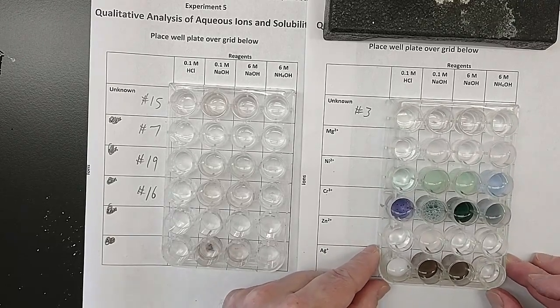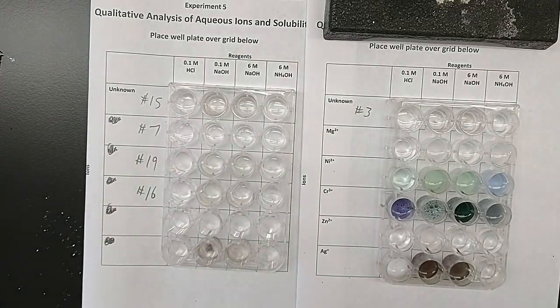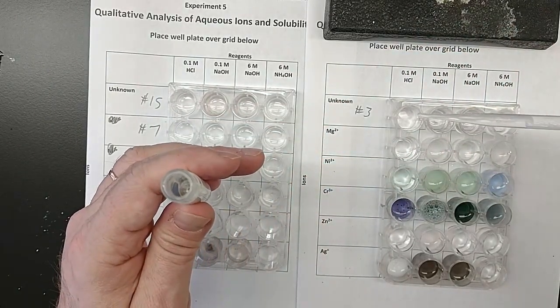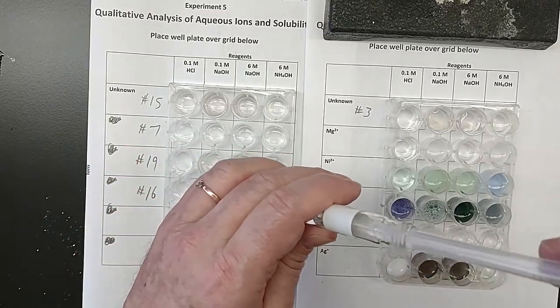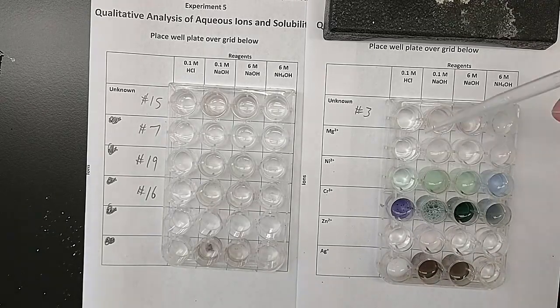Let's move on to the unknowns and see if we can figure out what it is based on its behavior. You'll be assigned one of these 5 unknowns. Unknown number 3. Starting off clear and colorless, see it in the tube. I'll add 10 drops or so, and stir.